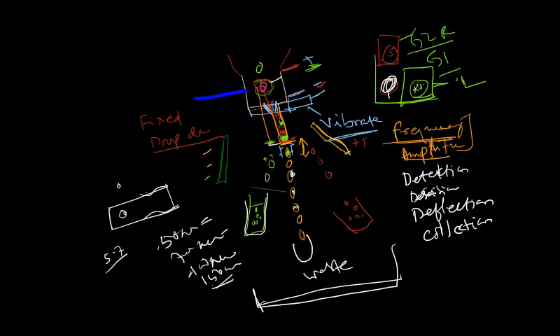I will talk in greater detail about how a sorting setup is done, all those things. However, the few things that you need to keep in mind are the size of the cell and the size of the nozzle that is used, and how we prepare the cells. There should be a nice single cell suspension. The better the cell suspension prepared, the better the sorting is. If a large clump comes through, it could clog the nozzle and completely distort the sorting process.